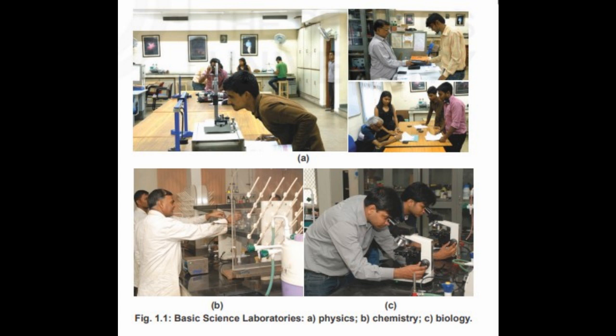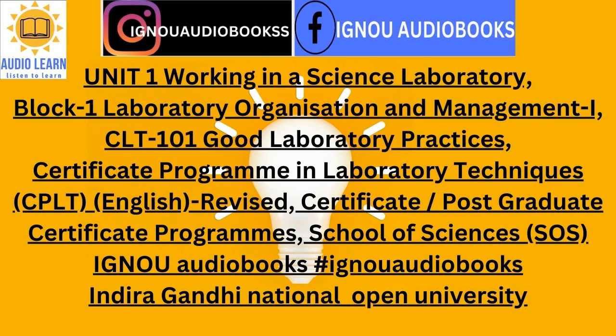carry out minor repairs, assist teachers in setting up demonstration experiments and the overall management of lab, assist students in using apparatus appropriately, record observations, collect samples, prepare solutions, maintain records, write reports, and keep the laboratory in a good working condition at all times so that it is an inviting place to work in. This list provides, by and large, the gist of your work.